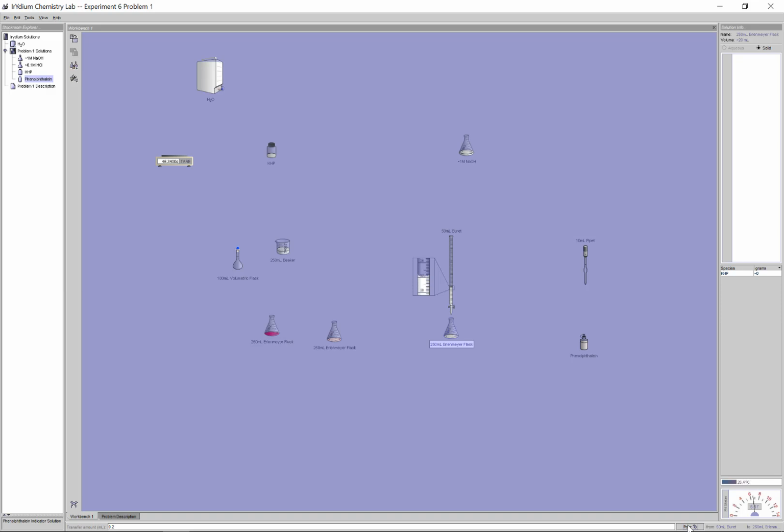Again, I'm getting really close to the endpoint here. Let's just drop it in a little bit slower than that. So again, 8.1, 8.2, 8.3, 8.4, 8.5. Still not pink yet, but I know the other one started turning color close to here. So if I can, let's drop in maybe even a half drop. So let's go 0.05 maybe. And therefore, I want to look for the palest pink color that we see. If it overshoots, I need to redo it.